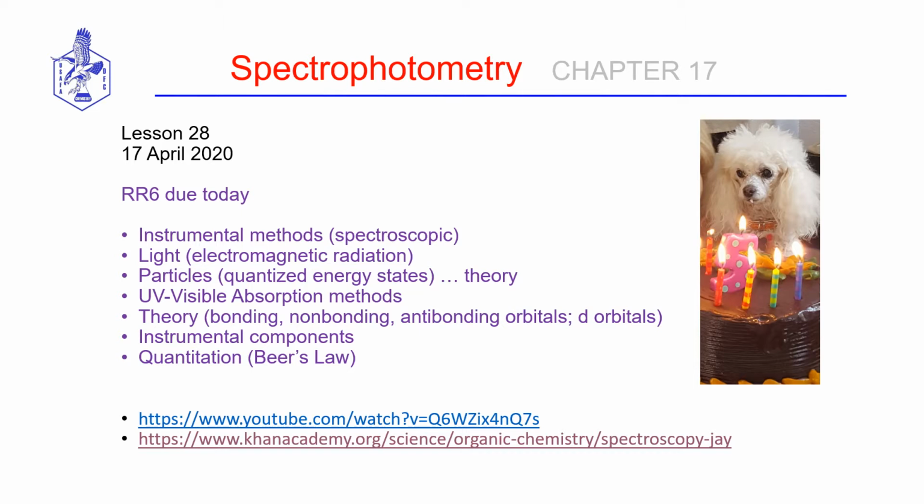With today's lesson, we're going to talk about basic spectroscopy and the different instrumental methods of analysis that have been developed to exploit the interaction of light with matter. We'll cover the fundamentals of wave theory and light. We will talk about quantum mechanics and the discrete energy levels that our atoms, molecules, ions, and subatomic particles exist in.